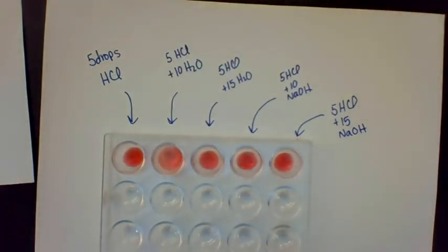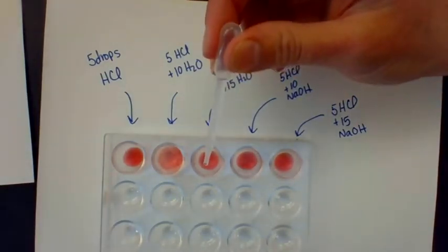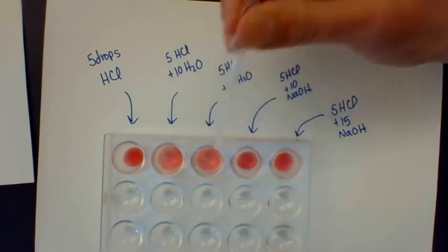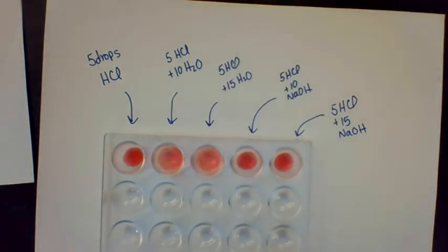Notice how I added a bunch of drops of water and nothing really happened. The color is still red. Now let me try adding 15 drops of water. 1, 2, 3, 4. And notice how the color is still basically staying the same. So the pH does not change very much when we are adding water.